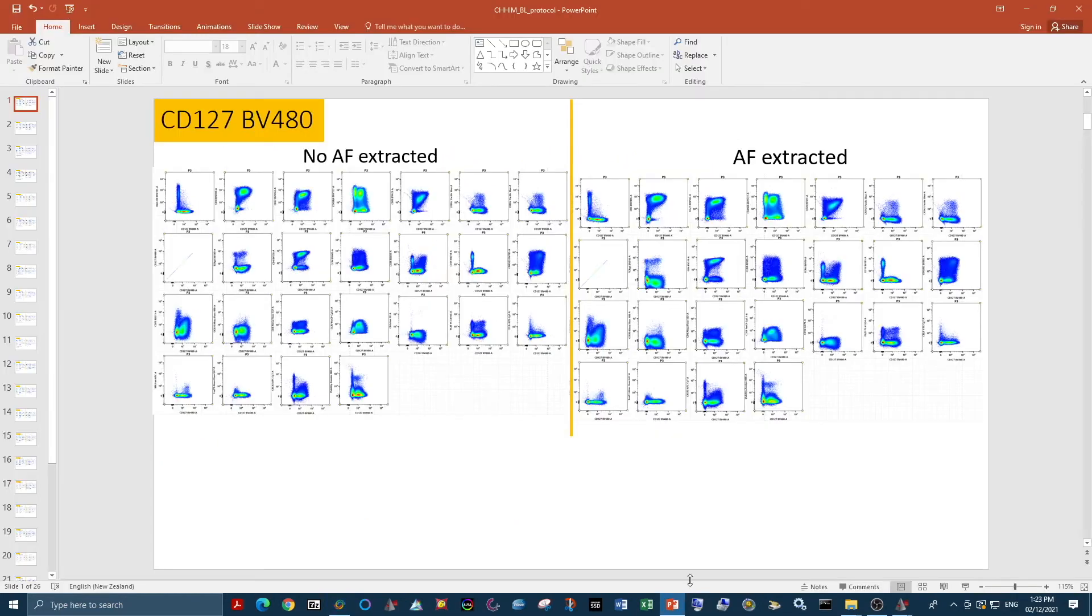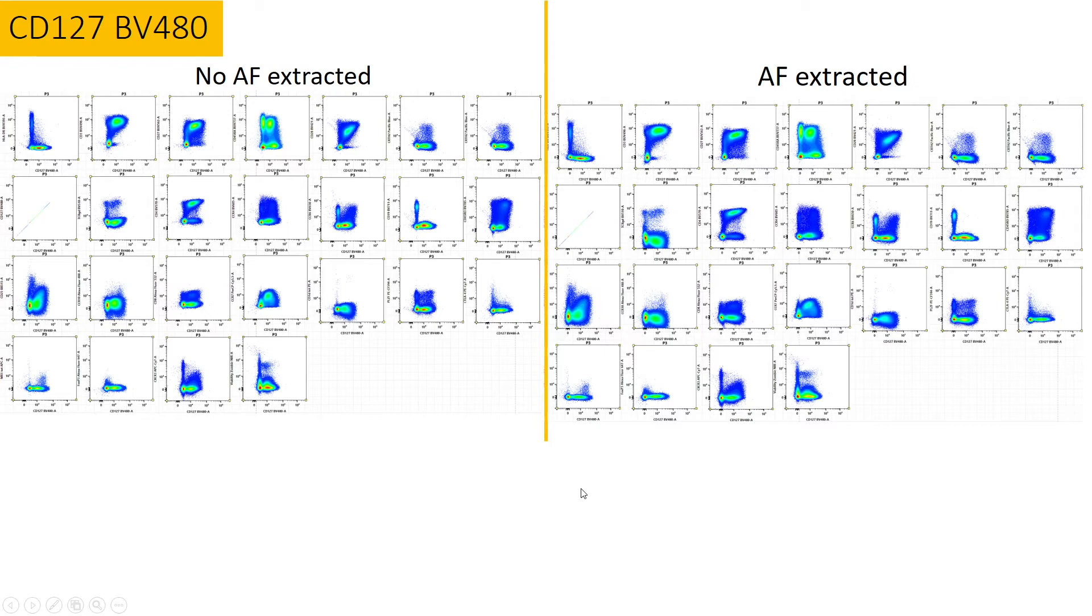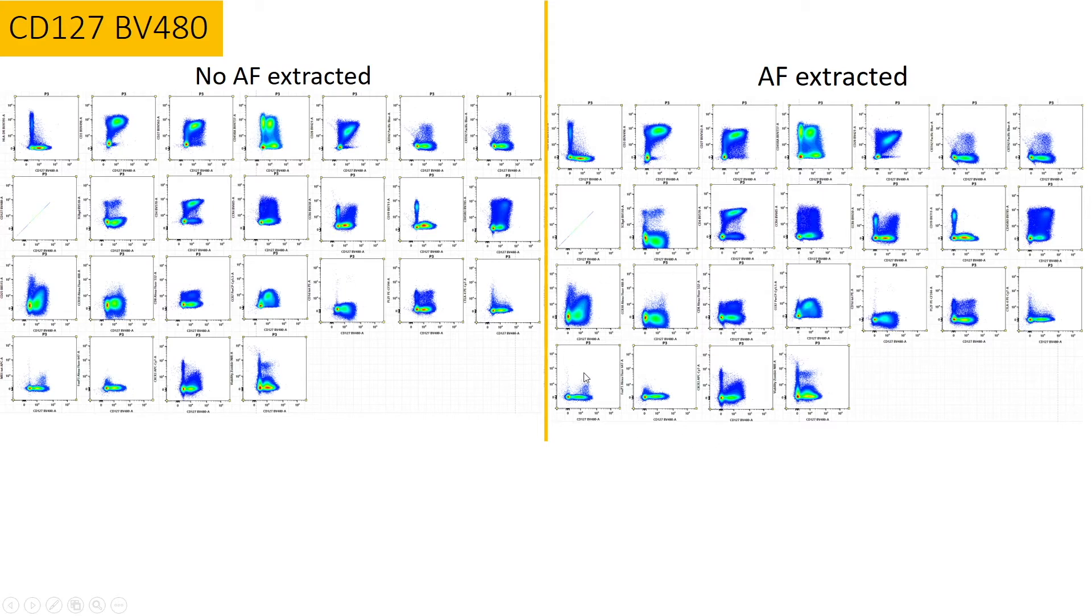It is helpful to place them side by side in a presentation and see what differences occur with or without autofluorescence extraction. Here's an example of a marker that without autofluorescence extraction, we can see space between the positive and negative populations. But when we extract autofluorescence, our negative shifts down to zero where it should be, but our positive stays in the same space. So we get better resolution between positive and negative.